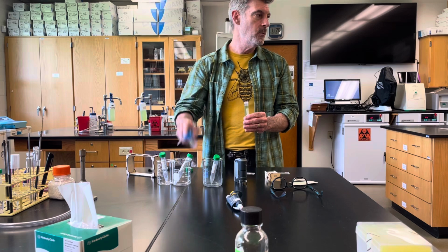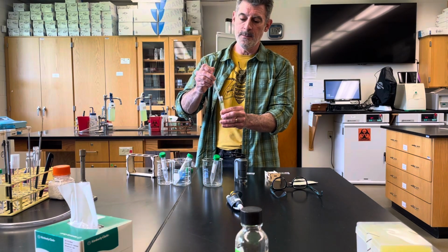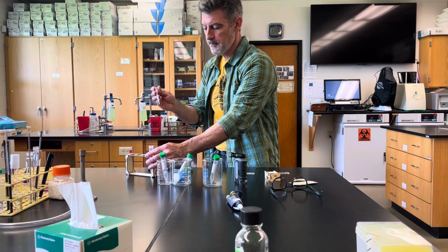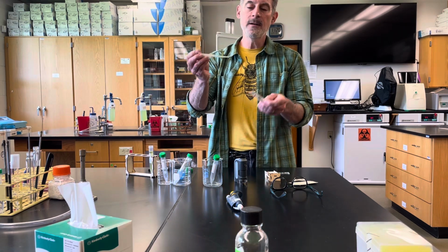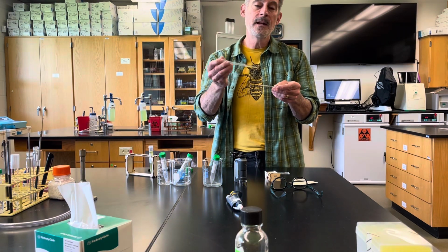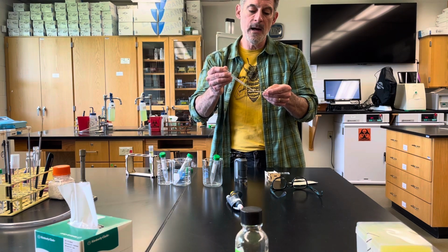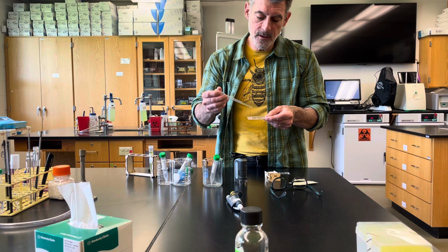I don't have the salt water here, so I can't do this to demonstrate, but if this were one of your already diluted tubes, all you need to do is with your little eyedropper, you need like 1 drop. You don't need any huge amount. You just take 1 little drop, and there's a little half circle area here.